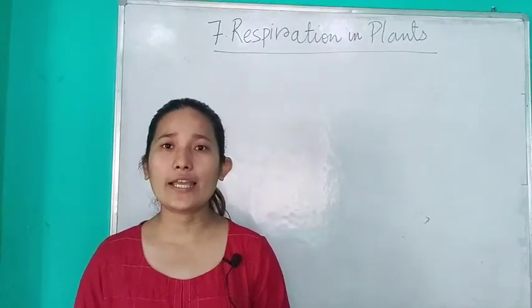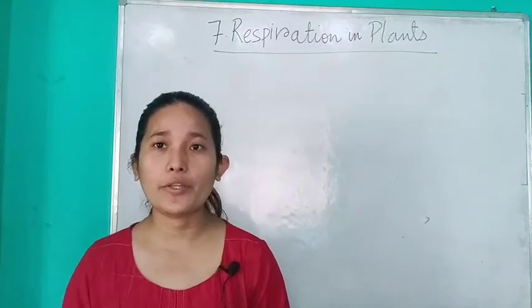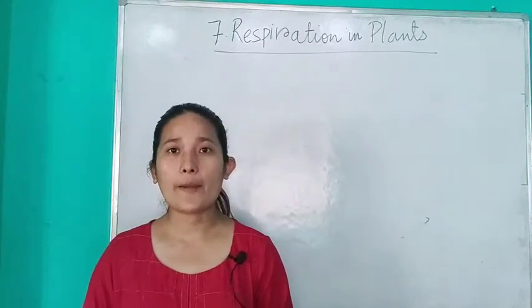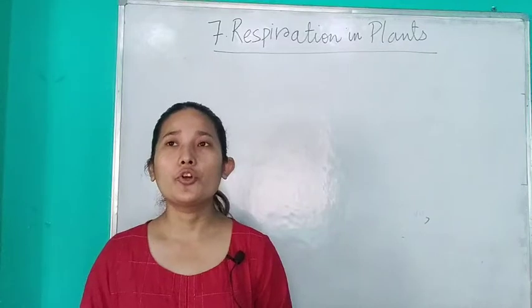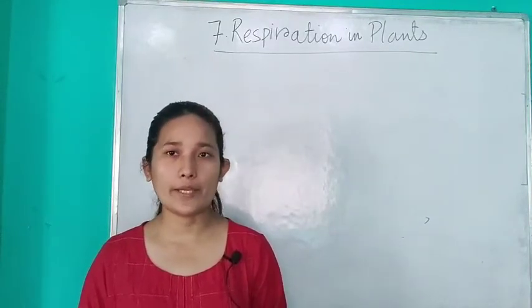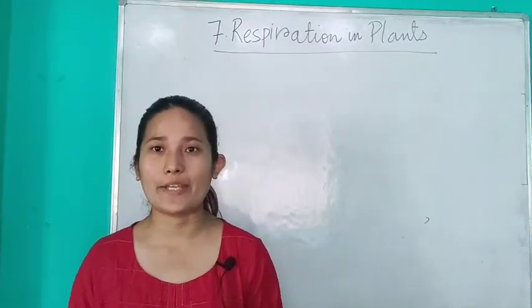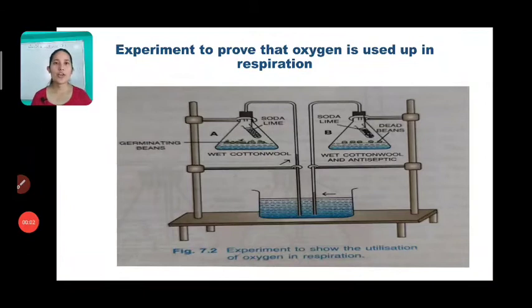There are certain criteria or conditions which are required for respiration. In order to discuss whether those conditions are met or not, we will be discussing a few experiments related to it. Now, let's carry on with the experiment. The first experiment is to prove that oxygen is used up in respiration.